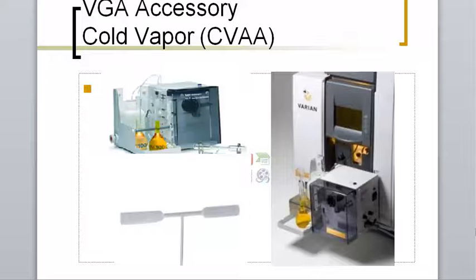There's a tube that goes into each one of those solutions. Those solutions get sucked up. Here's the pump that does all of the pumping. So you want to make sure that your tubes are pretty taut against the pump. If they get loose, they won't suck up the sample. And this is sucking the sample and your solvents up, and it goes into the mixing chamber itself.